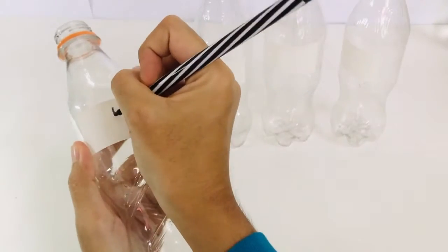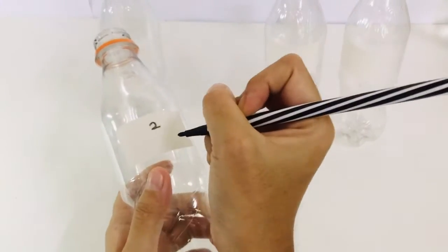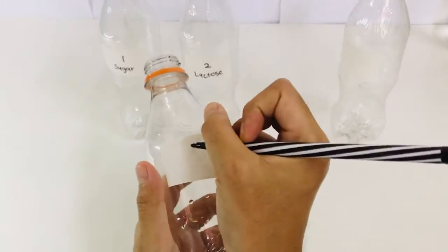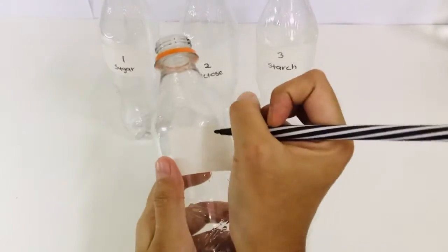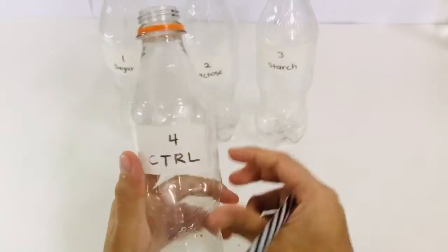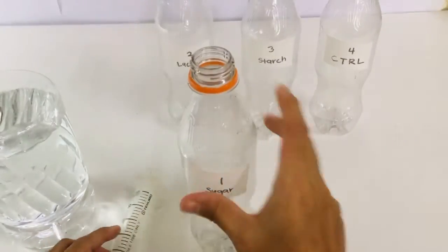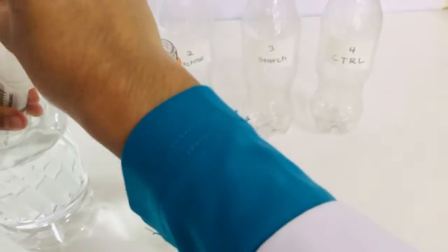Firstly, wear lab coats and safety goggles, and then label all the empty bottles from 1 to 4. Bottles 1 to 3 will have yeast, carbohydrates, and water, while bottle 4 will have only yeast and water with no carbohydrates. Next, fill each of the bottles from 1 to 4 with warm water.